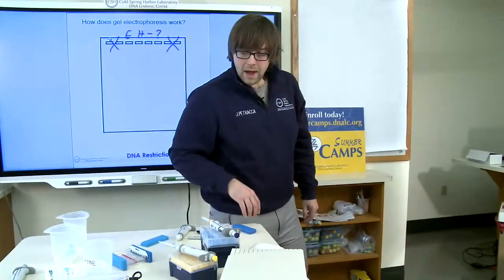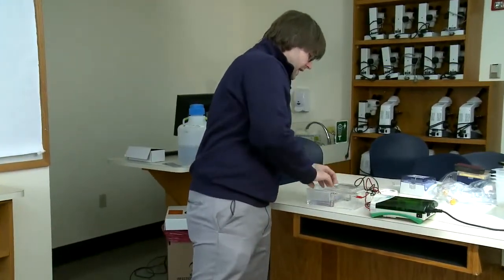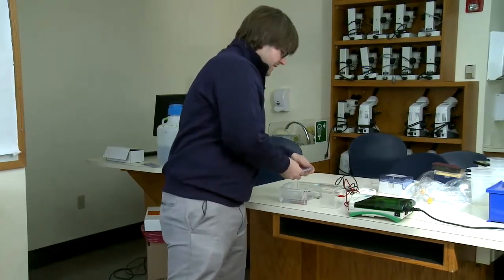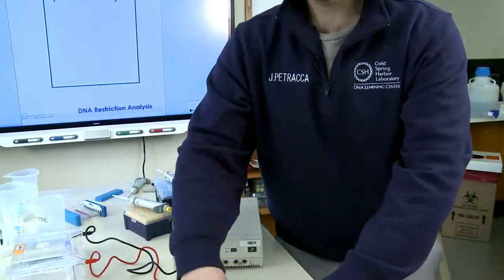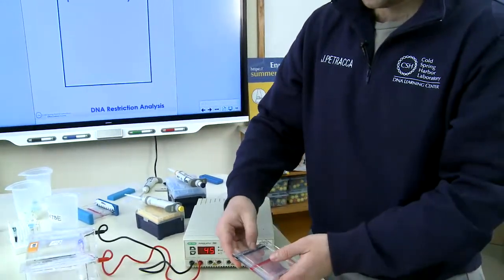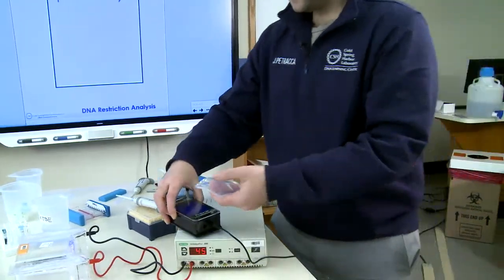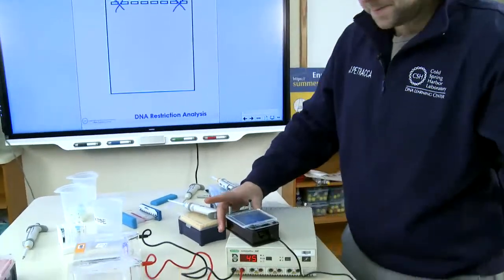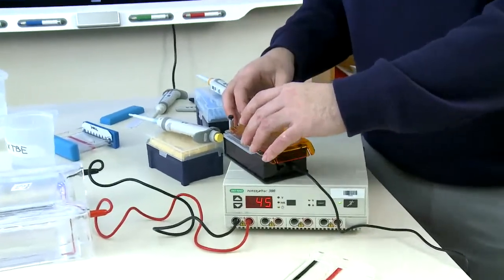In the meantime, though, I've already prepared a gel for you guys using the same mystery restriction enzyme. So let's take a look at what we should see. So this little machine here is a little sort of handheld illuminator, and it sends this.